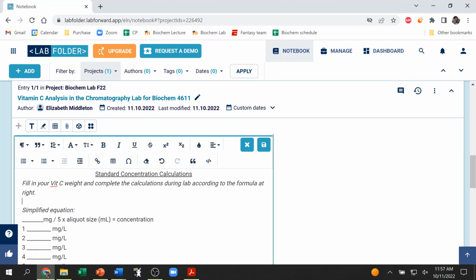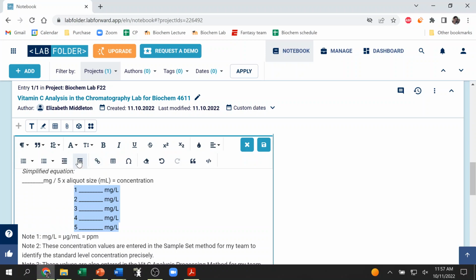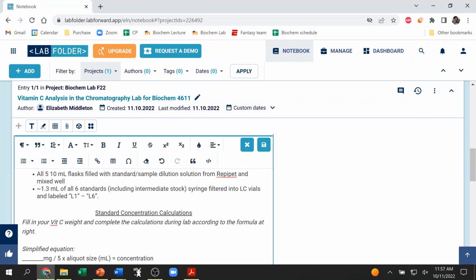These were supposed to be lined up over to the right a little bit, so let's go ahead and move those over, and maybe put in a few tabs. Okay, so at this point, I think you have an idea of what you should do to format it once you've either imported or pasted it so that you have a workable procedure.